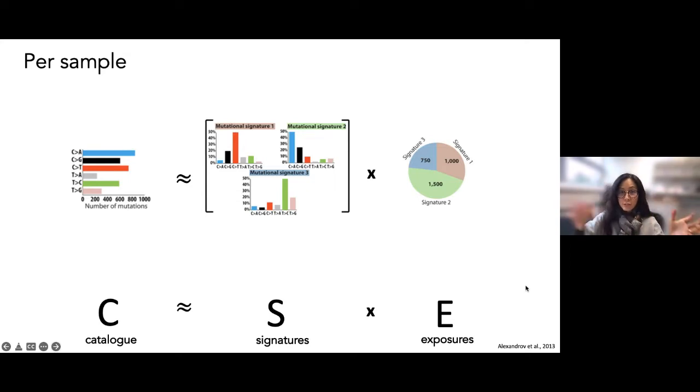And you saw that previous image of the visualization of what that looks like. It's actually such a simple function. I think a lot of people really worry about mutational signatures being complex. It's really, really quite simple. So that's all it is. You'll remember this forever now. This is for a single sample.